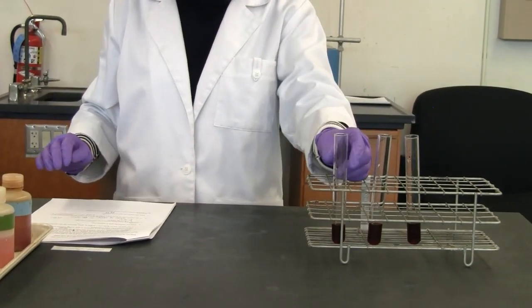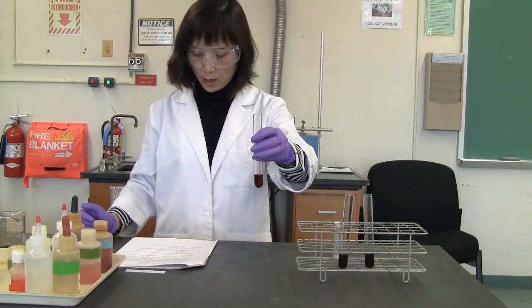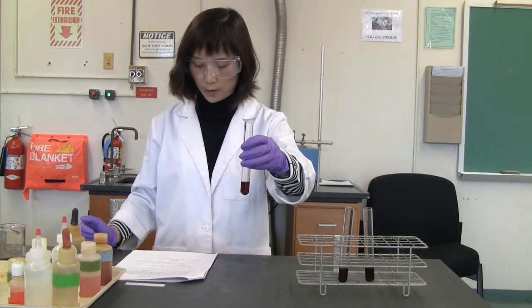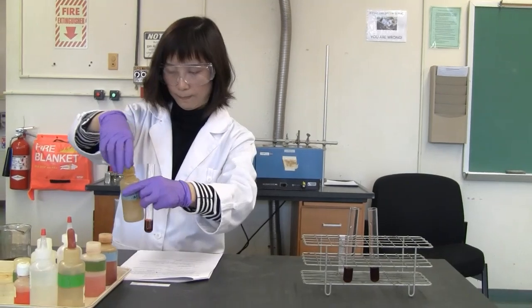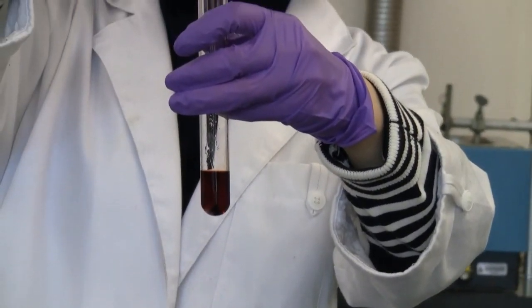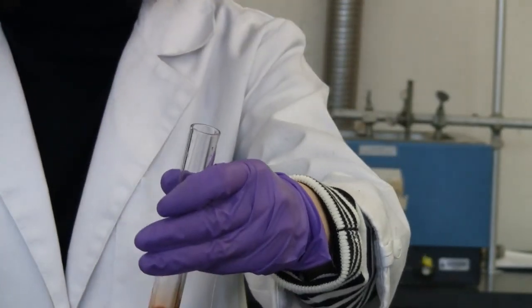Okay, so now step 2, to test tube number 1, I'm going to add 20 drops of the KSCN. Then you're gonna watch the color change, then decide the equilibrium shift direction. Okay, so I'm going to add 20 drops. 1, 2, 3, 4, 5, 6, 7, 8, 9, 10. That's 10.